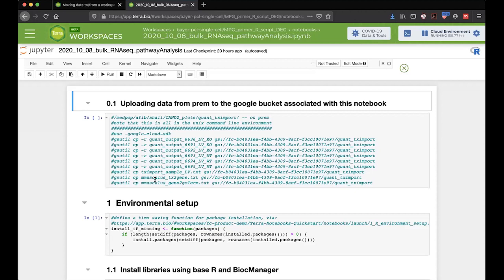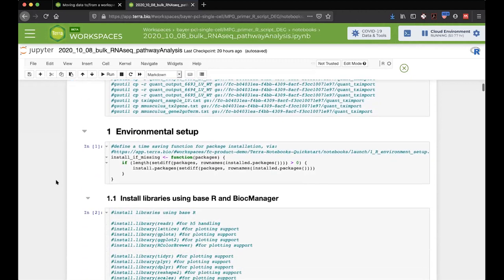It's very easy to accomplish locally, but I basically made 2 files, one that goes from an Ensembl versioned transcript to the external gene name, and another that goes from the external gene name to a gene ontology term. And so those I've uploaded so that we don't have to worry about pinging the server and winding up with errors. But those you should be able to accomplish locally in RStudio pretty easily.